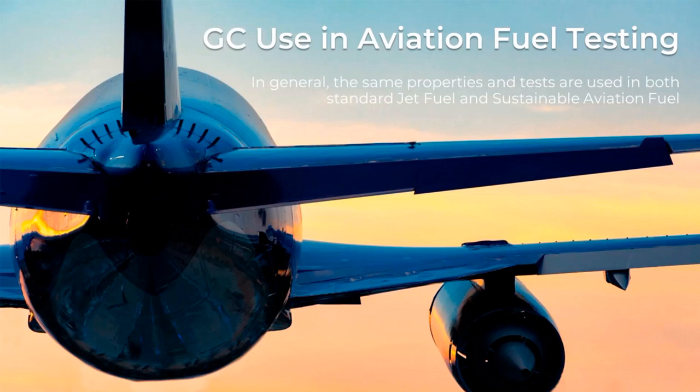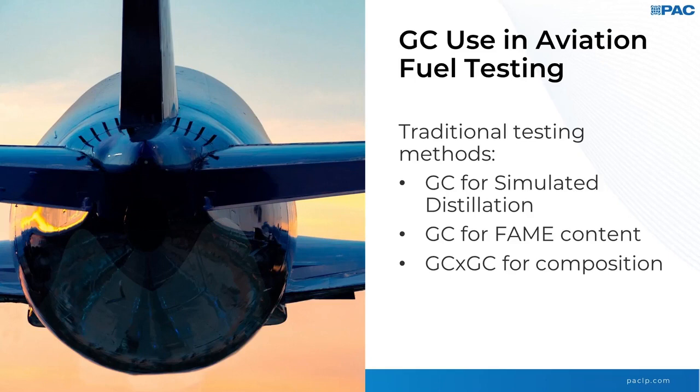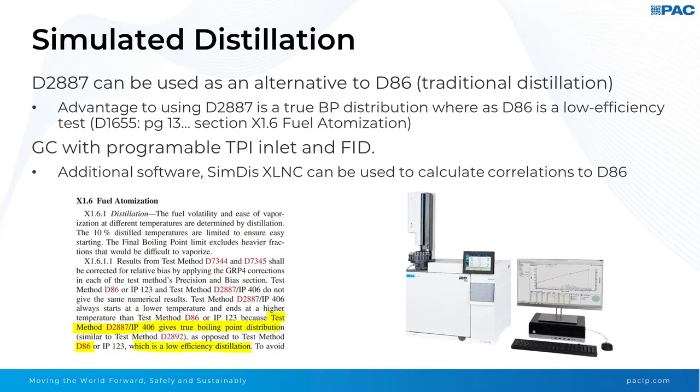There are three types of traditional testing methods: GC for simulated distillation (SIMDIS), GC for FAME content, and GC by GC for compositional analysis. Simulated distillation: we are using D2887 in this application. This is a test method used to determine the boiling point distribution of petroleum products by GC method.